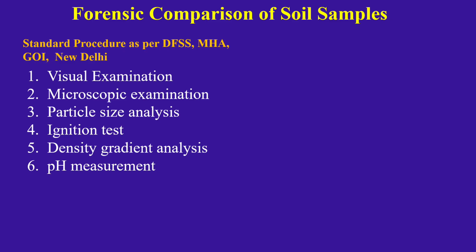The first standard used for forensic comparison I have brought from the DFS, MHA, Government of India, New Delhi. They have a manual available on the net, open source.